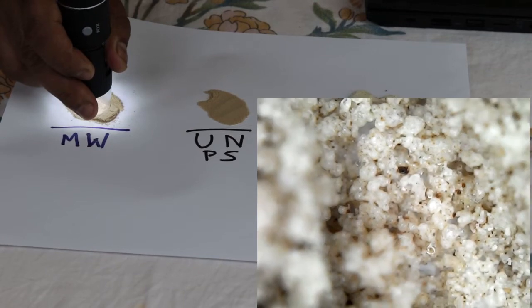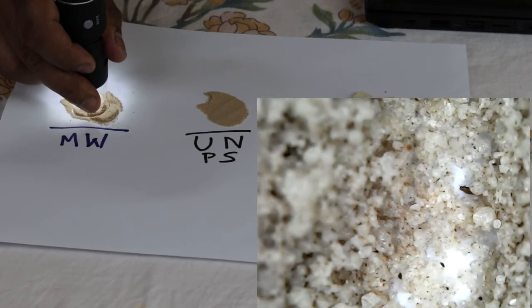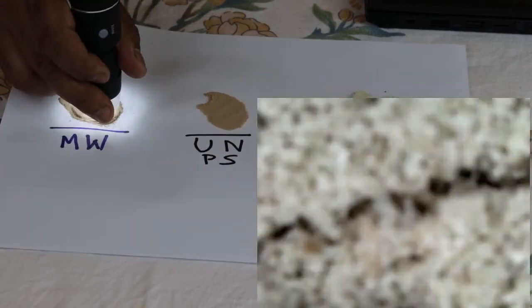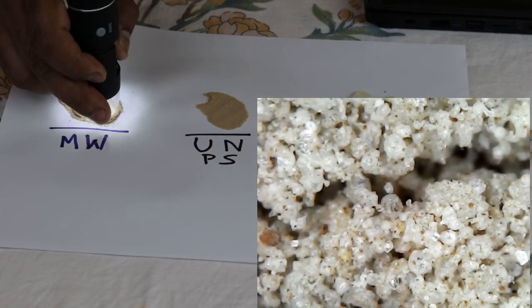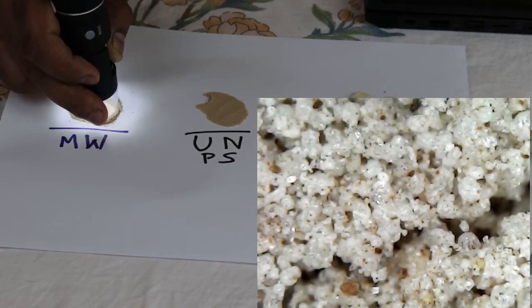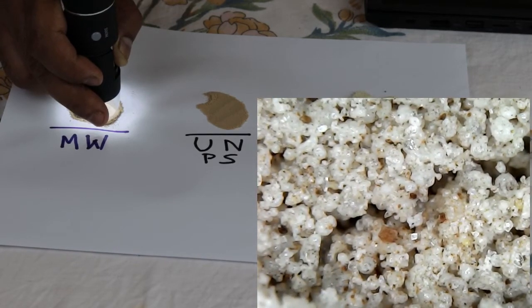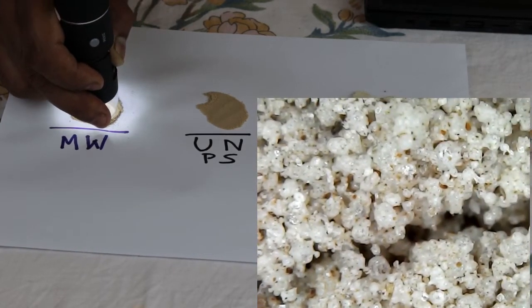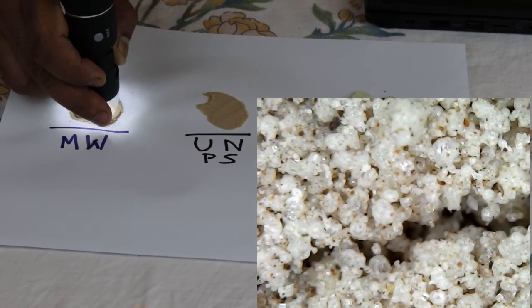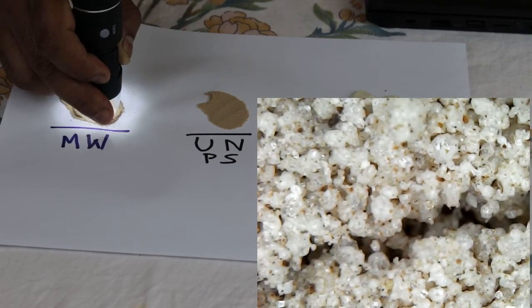I think those are sucralose, and there are these whey protein granules. Of course, you do see these big chunks of cocoa, right? Now, of course, they do add a bunch of other stuff like ashwagandha and all, but I don't know. Maybe these are the yellow things that you see. If you look at the screen, there are some tiny little yellow things. Let me see if I can get those in the middle. Yeah, do you see those? A bit different texture, maybe those are the stuff, but nothing really odd or stringy. If you want to see how things look odd, then do check out my microscopic test of Alms Nutrition Mass Gainer.